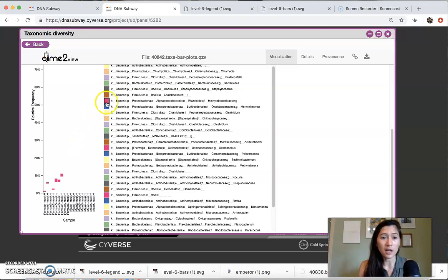So like I just showed here, here's one for you, that one's only present in females, and you can click around. So if I wanted to add in an additional one, so now I've clicked both this pink and blue one, and actually both of those look like they are only present in females. So that's the way for you to kind of build this customizable plot.